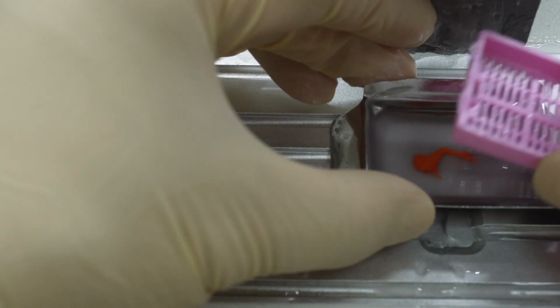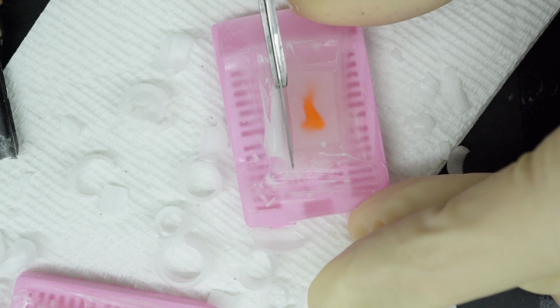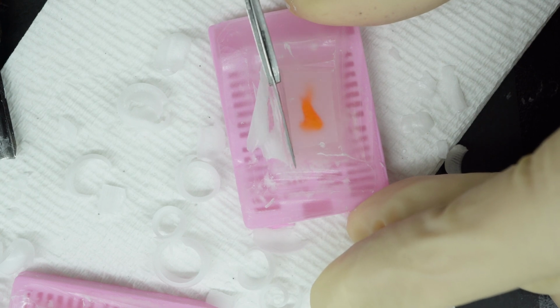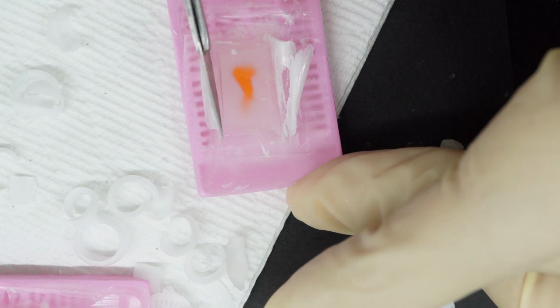And then you typically mount this mold onto a plastic cassette. What's the cassette for? It's just a holder, basically. It provides a standard frame that clips securely into the microtome, the slicing machine. The guide mentions a couple of ways to mount it, depending on size and goals. All right, so we have our perfectly oriented embryo embedded solid in a paraffin block ready on its cassette.